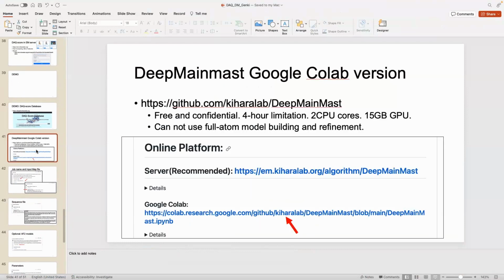Okay, so far, do you have any questions or comments? Is this only for protein chains, or also others? Currently it's only protein chains, but we are developing nucleotide and ligand support. Later, I hope we can show some results. But currently protein structure only. And when I upload a structure, do I have to remove the ligand? Yeah, they are automatically removed. You don't have to worry about ligands or membrane backbones.